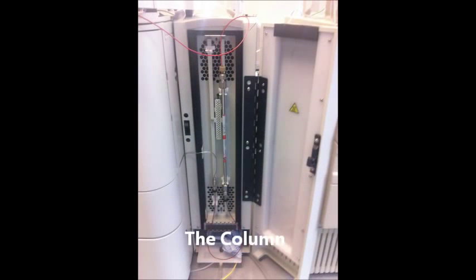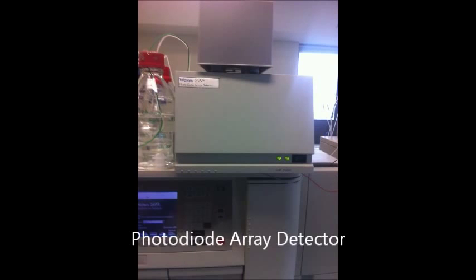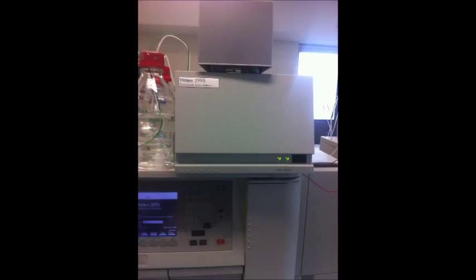The separation is performed inside of the column. The column contains the chromatographic packed material needed to effect the separation. The packing material is called stationary phase because it is held in place by the column hardware. The detector is needed to see the separated compound bands as they elute from the high pressure column. The information is sent from the detector to a computer which generates the chromatogram. The mobile phase exits the detector and is either sent to waste or collected as desired.